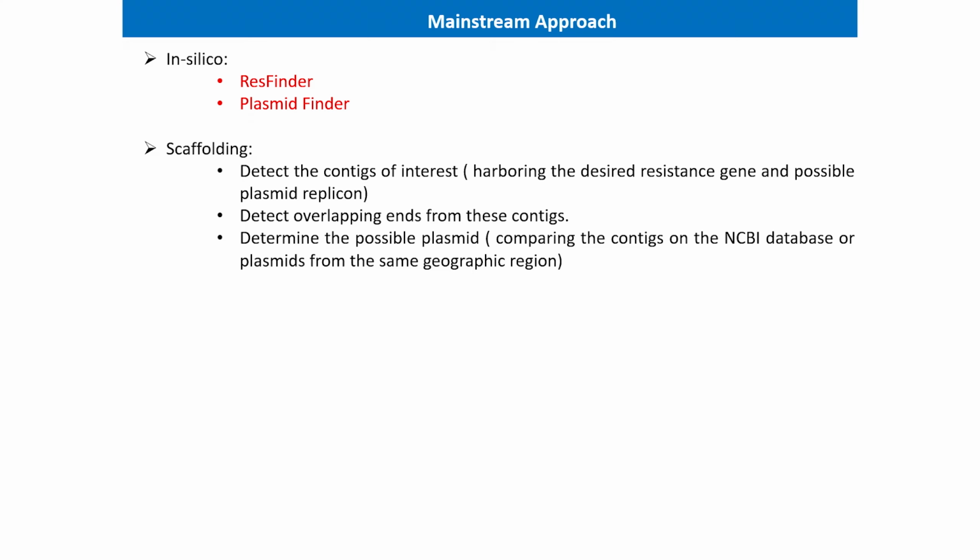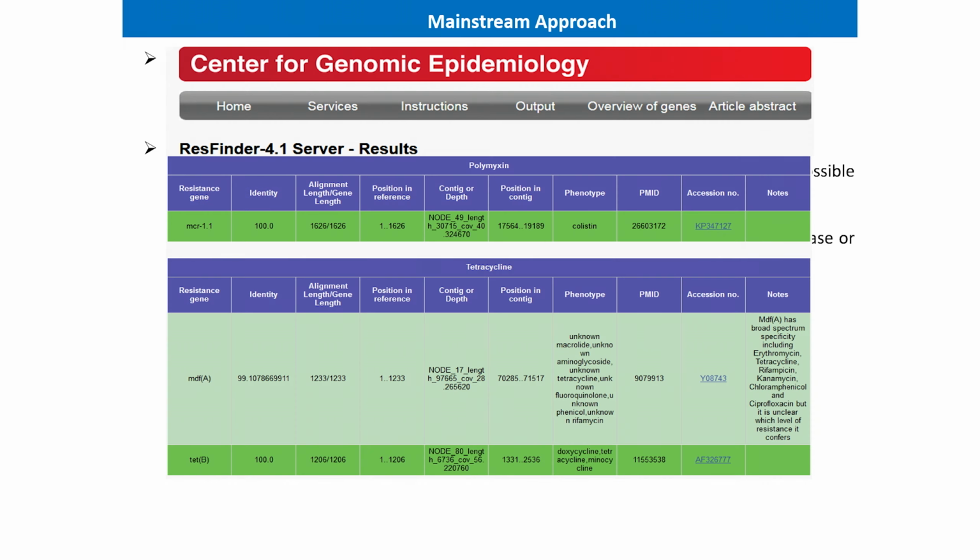In our antibiotic-resistant microbial genomics, normally we upload our assembled genome into online databases that can tell you the position of an antibiotic-resistant gene, such as ResFinder. And if it's found in a plasmid, the plasmid has a replicon gene. When you upload it to PlasmidFinder, it will tell you where the replicon of the plasmid is. For example, we have here MCR-1, and this is the gene for which Obama, when he was president, sent out a call for action because of superbugs. It was because of this gene. It's a mobile colistin resistance.